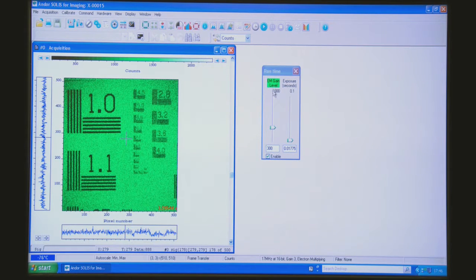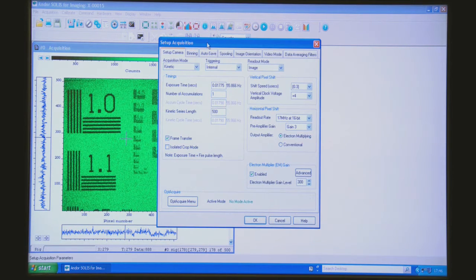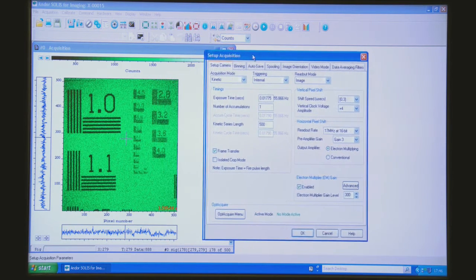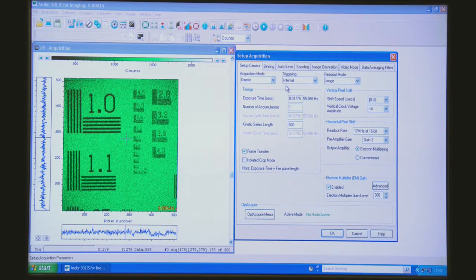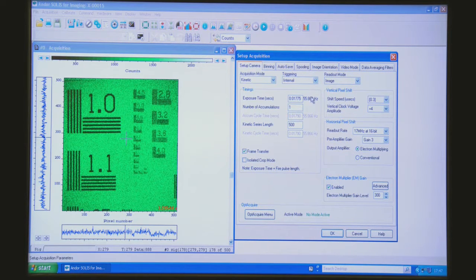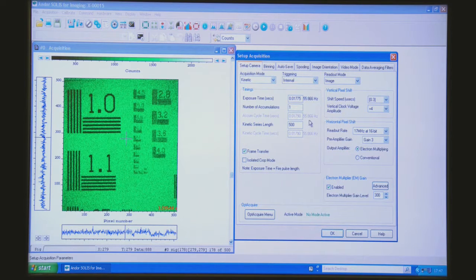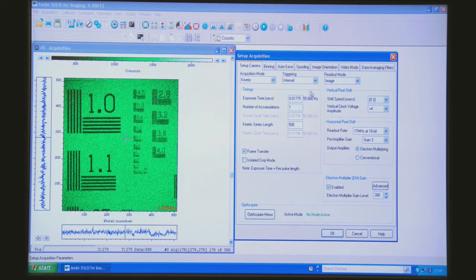We're going to open up the main setup acquisition dialog once again. This is already set up for very fast full frame rates. We're looking at 56 frames per second there. It's within the 17 megahertz fastest readout speed again.